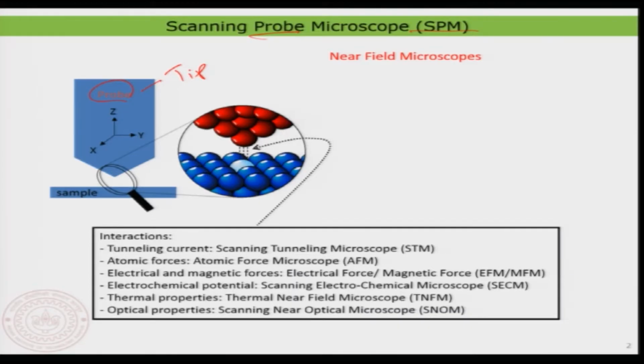So what you have is always a probe, but the probe is capable of scanning along the x, y, and also along the z direction. That is the key point. You can access all 3 different axes while using this probe. Now you take a surface, bring the tip on top of the surface, scan across the surface, and probe what is on it. That is exactly what a scanning probe microscope does.